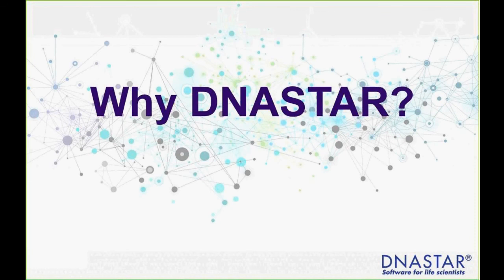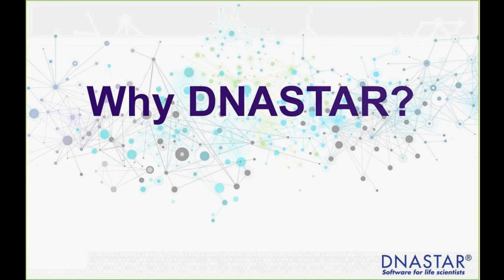Why DNASTAR? DNASTAR has a solid 30-year track record of developing, supporting, and responding to the needs of today's researchers. For example, we have always been among the first companies to support new data types, trends, and workflows. This continual development has created today what we call our DNASTAR Lasergene suite.